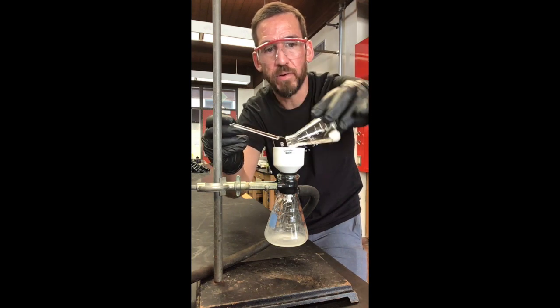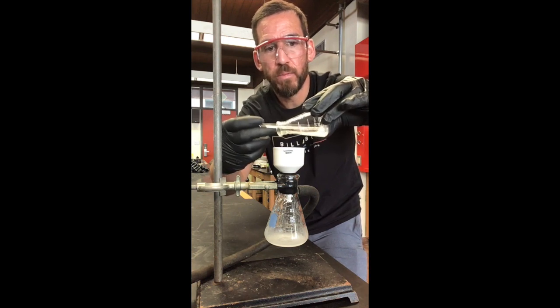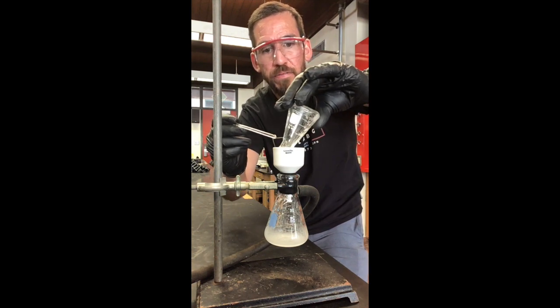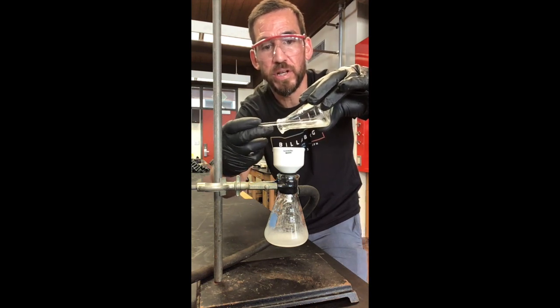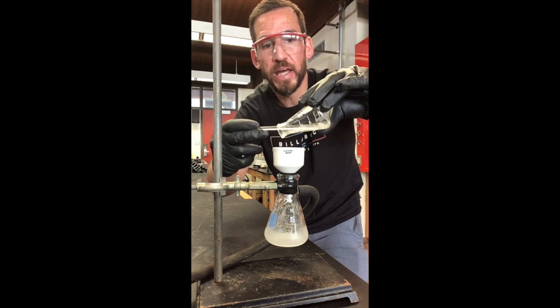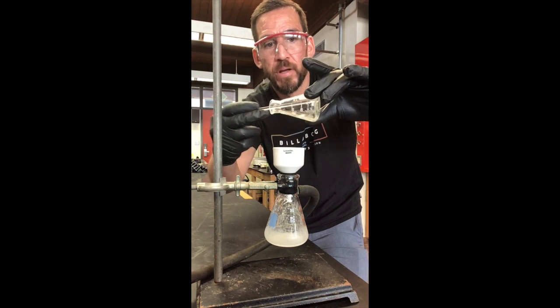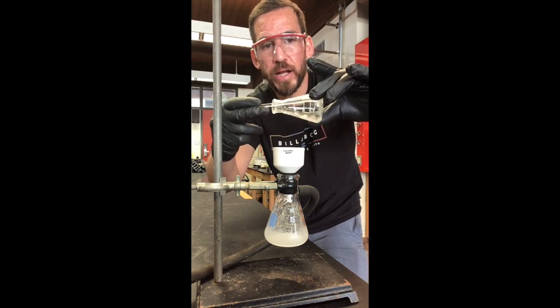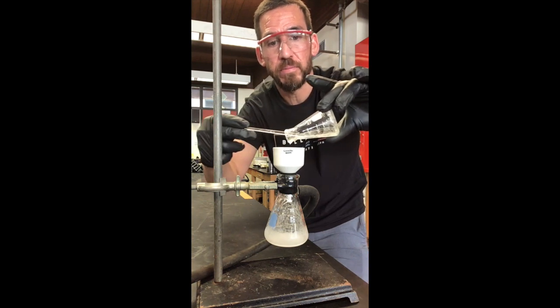You can see stuff going down, and then I still have more in here. If you wanted to rinse your caffeine to maybe get the rest of it out of this particular flask right here, you don't want to rinse with just regular old ethanol because it is soluble in ethanol, right, to some degree.